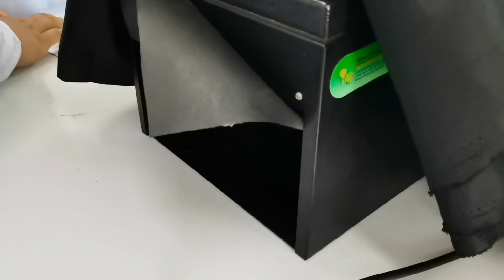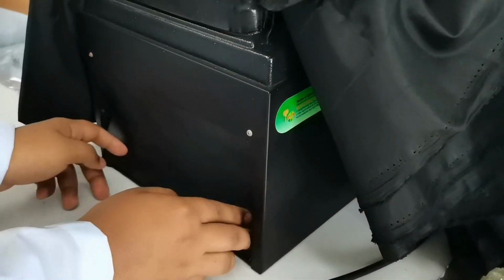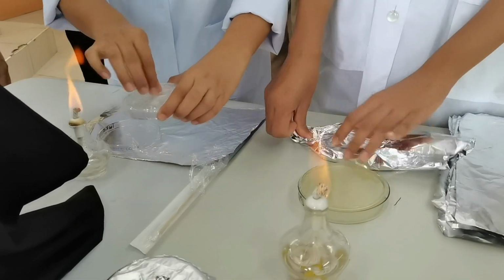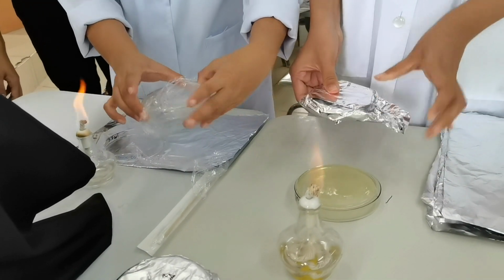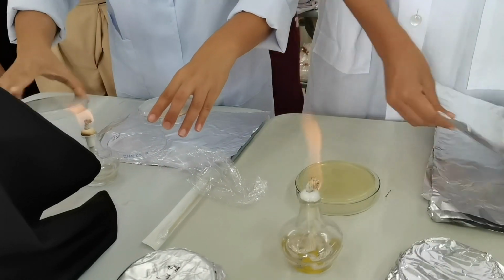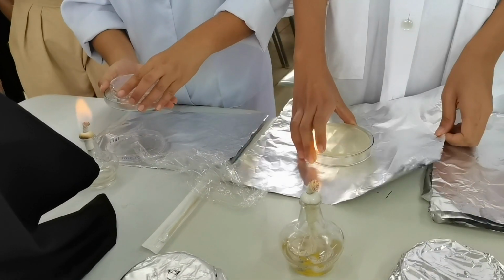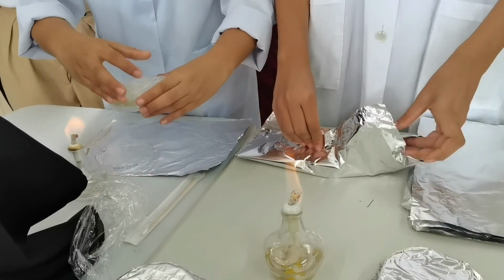When they're done, they remove them like this and cover half of the plates with foil, and the other half is exposed to visible light for about 2 hours.